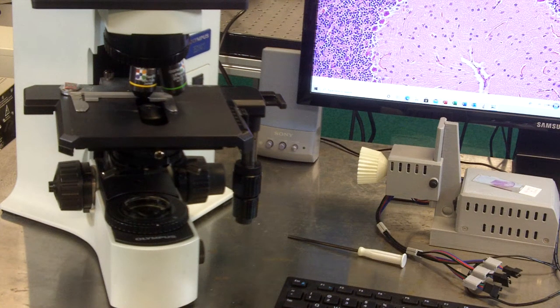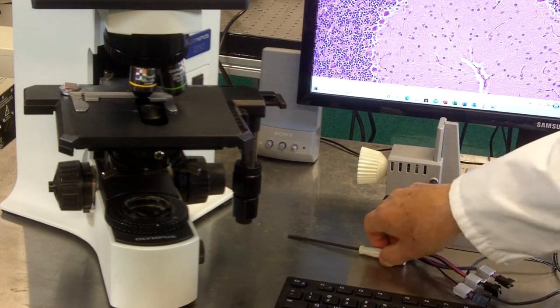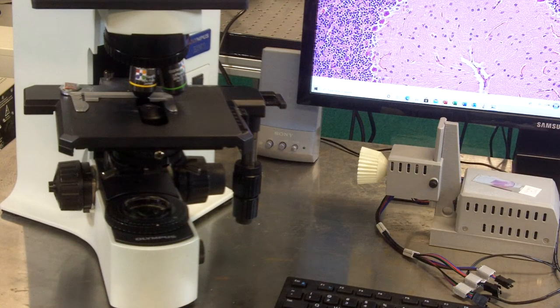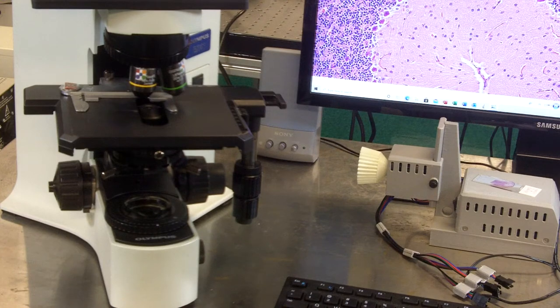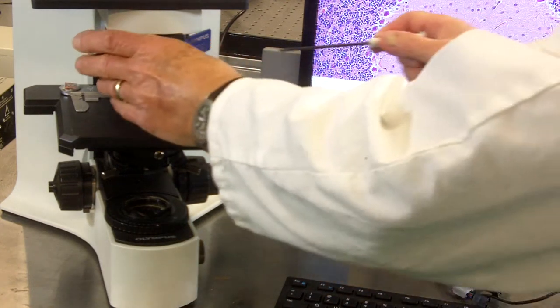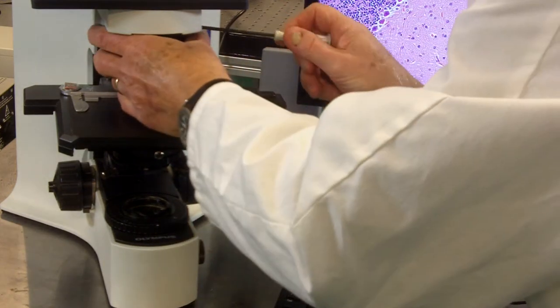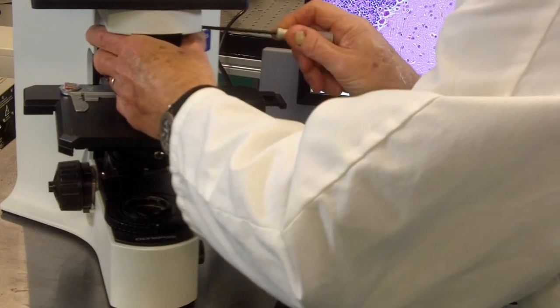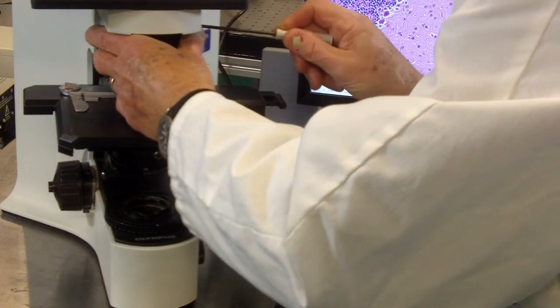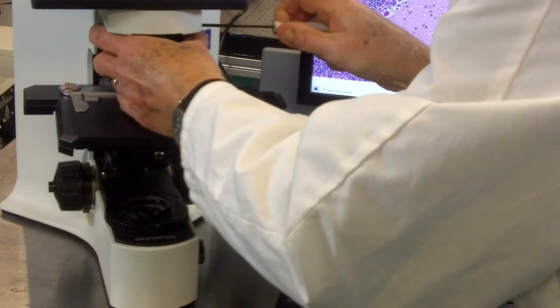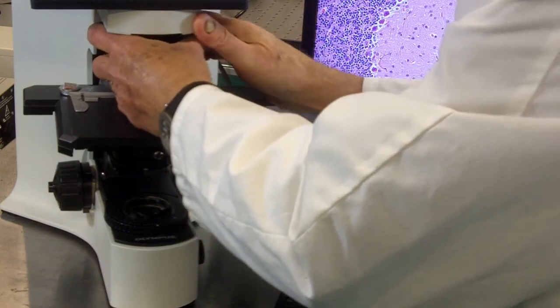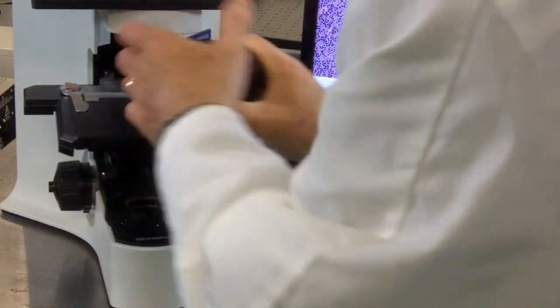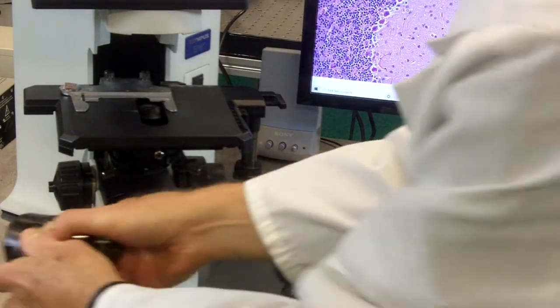This is part one of the Bunton RetroBot installation on an existing microscope. Here you'll see an Olympus BX41 microscope. The first thing we're going to do to install the stage is to remove the optical system, the optical nose piece, by simply loosening a set screw and then the optics will slide right out. We'll put those aside for the moment.